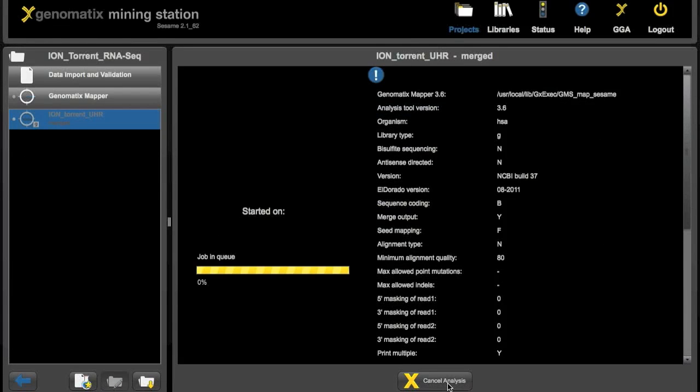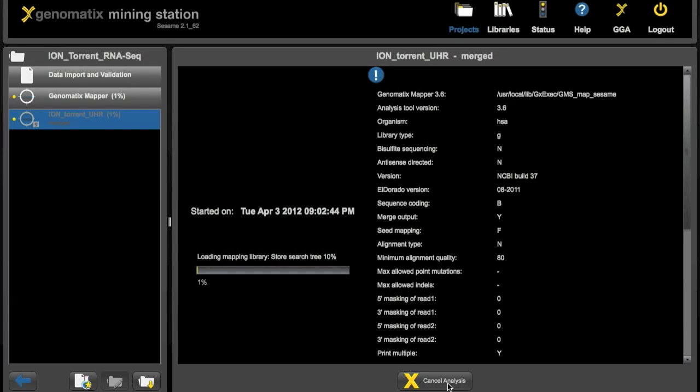Hitting submit finally will put the analysis in the job queue. And if there's still a free slot on the machine, if there are not too many other jobs running, the analysis will get started right away like here.